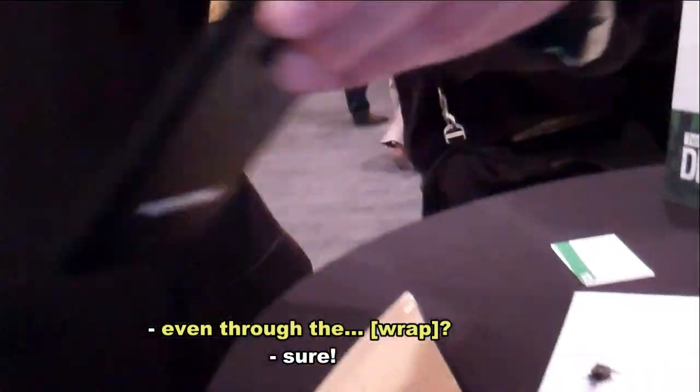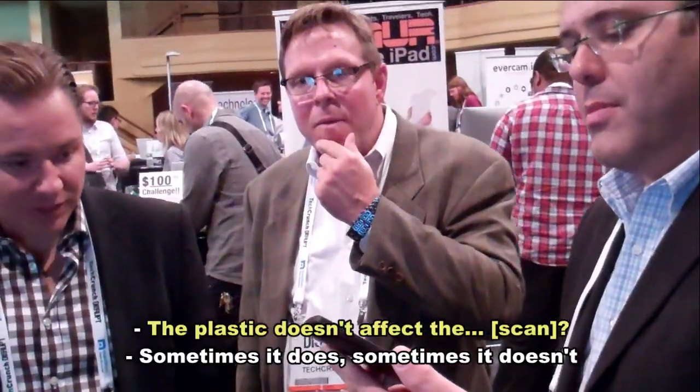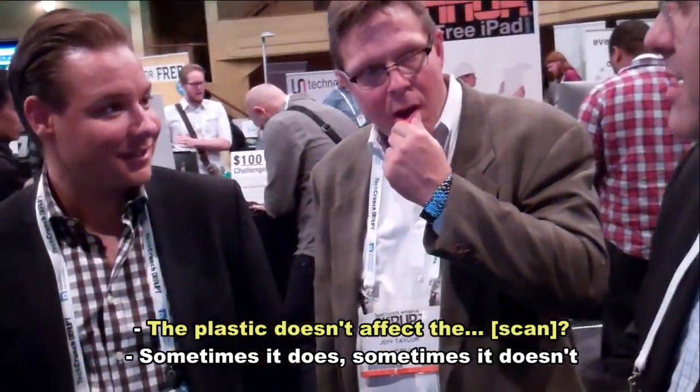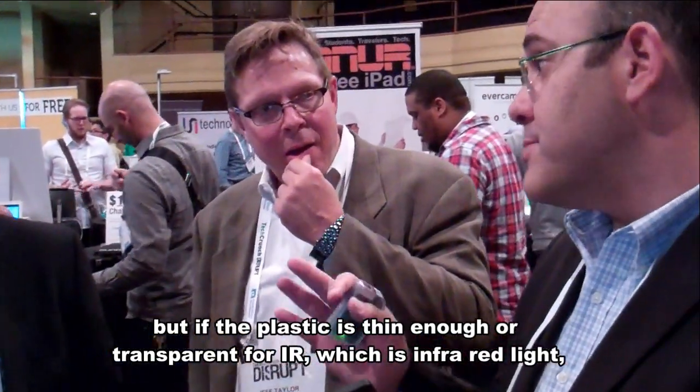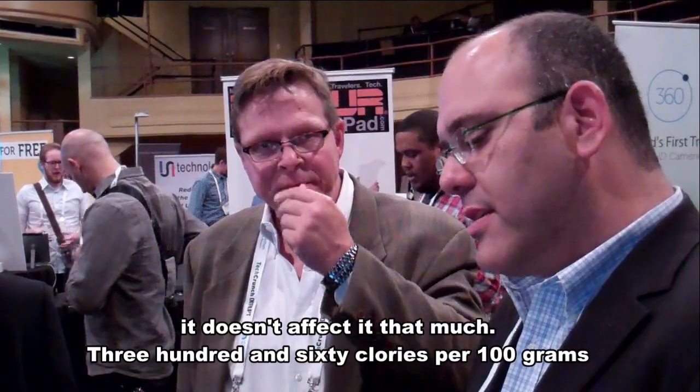This is 48 grams of fat per 100 grams. So the plastic doesn't block it? Well, sometimes it does. For example, aluminum wrap is totally blocked. But plastic is thin enough — it's transparent to infrared light — so it doesn't affect it that much.